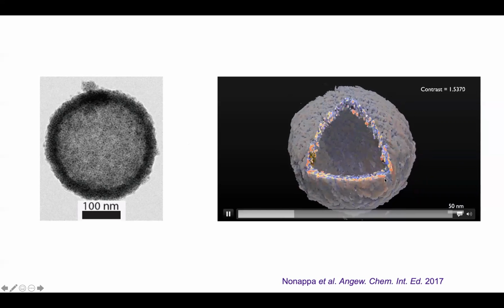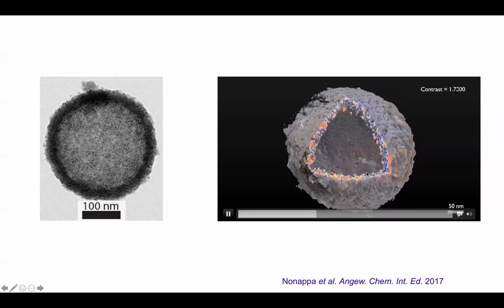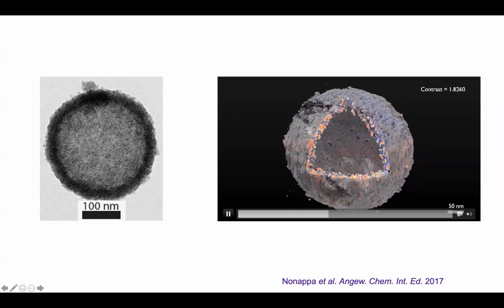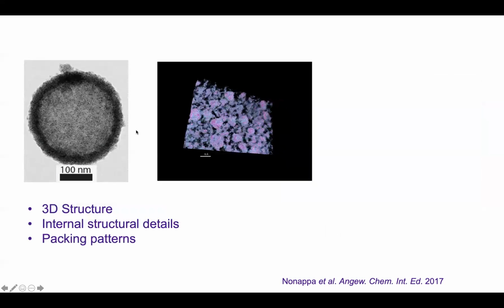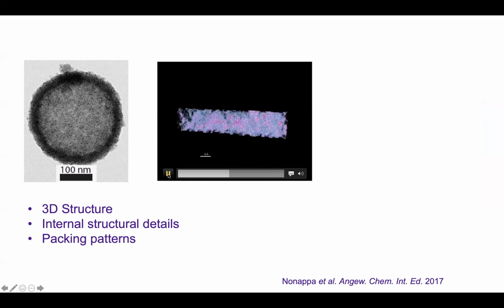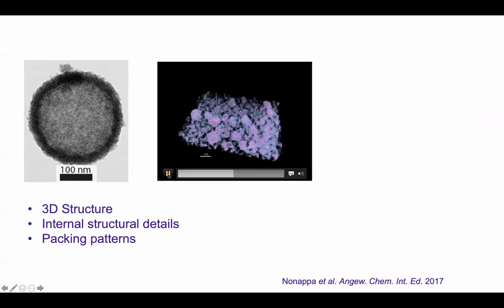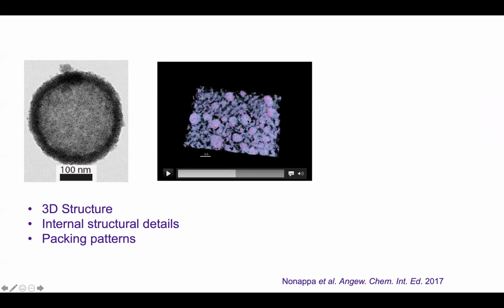That's not all. We can also precisely determine the thickness of this shell, and it's 3 to 4 layers of nanoparticles. If we go a little bit higher, we can take a small portion of the shell, and from the shell, we can determine how each nanoparticle is arranged, as we can see individual nanoparticles. It also shows the amorphous structure, which is organic material. You can take them out, and individual nanoparticles are not uniform, as you can see the size variation.